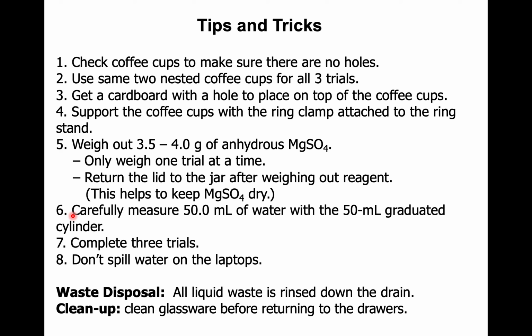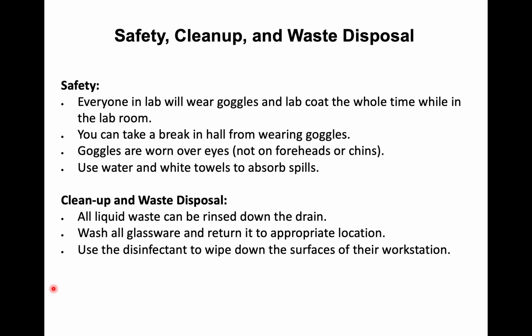Carefully measure out 50.0 mLs of water with the 50 mL graduated cylinder. You want to complete a total of 3 trials, and please be careful not to spill water on the laptops. For waste disposal, all liquid waste is rinsed down the drain, and for cleanup, please clean the glassware before returning it to the drawers. As far as safety, basically the same safety that we always have.